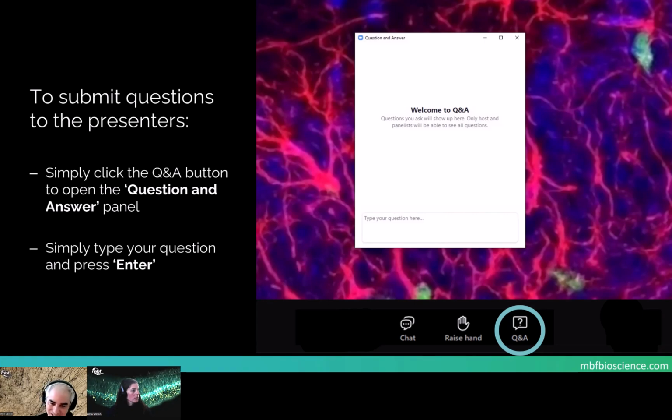Thank you. There are questions about cost. You can just contact us separately and we'll send you a quote. We have people from different parts of the world, so saying numbers here wouldn't make sense for some people. So please contact us directly at info at MBF Bioscience, or directly to us, and we can provide quotes for that.